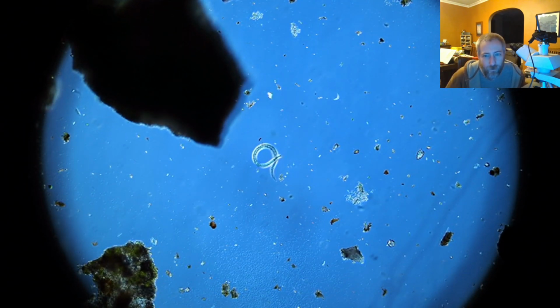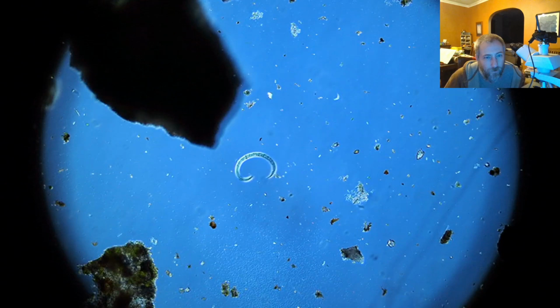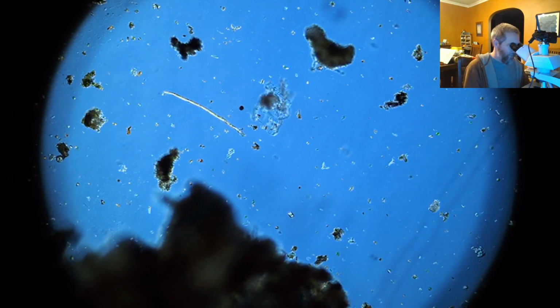So here's a little nematode worm squiggling about. Yeah. There's one new thing. This is what I saw the tardigrade basically trying to shove in its mouth hole one time, and I just started chomping on him. I guess it was dead at the time. I think it started off dead. I don't think the water bear had caught it and killed it, but I suppose it's always a possibility. Here's another little nematode. Whatever I put in, I brought in a bunch of nematodes that weren't in here. Here's a couple of these little guys crawling around. The rotifers.